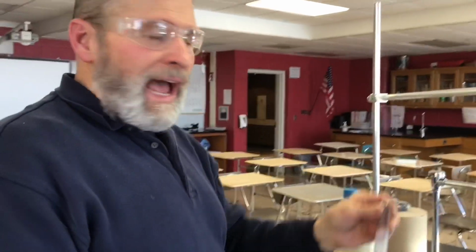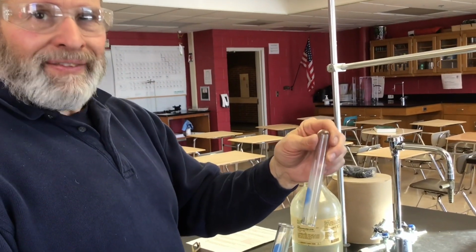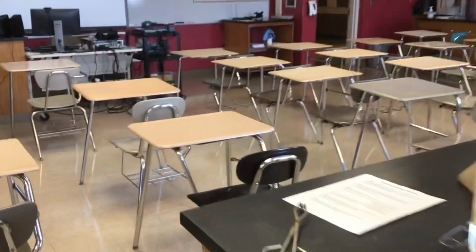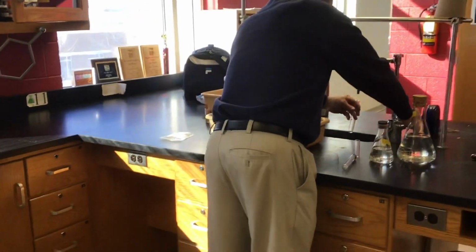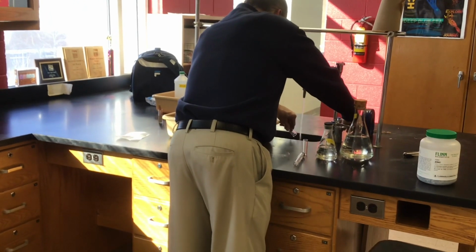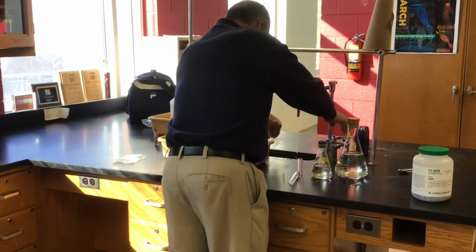Now, I don't know if you can do this on the video, but if you can slow it down, you're actually able to see the combustion going on there. It's pretty impressive. It happens so fast you can't appreciate everything that's going on. The chemistry term for that is a bark. We say the hydrogen barks when you light it. It burns fast. It's a very light gas. It's the lightest gas. And so when it burns, it really goes fast.